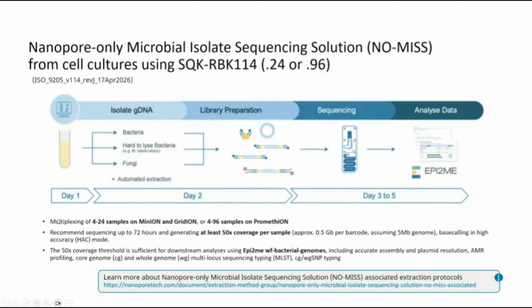Normally the first step is to isolate the genomic DNA from the samples and proceed to library preparation. Once the preparation is done, we load the sample into the flow cell, put the flow cell into the device, and start the sequencing. While the sequencing is still ongoing, or once sufficient data has been gathered, we can start the data analysis. This process normally could take a few days.